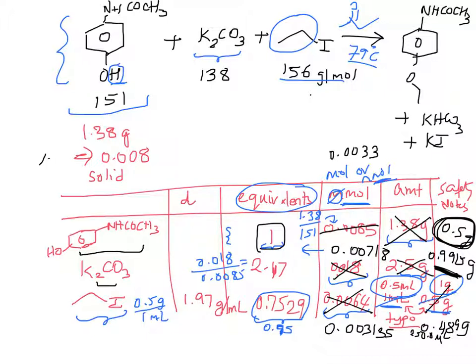I believe it was 15 milliliters of the 2-butanone, right? So since the ratio in terms of moles is about 0.388, my solvent could be approximately around 6 milliliters or so. And that should be plenty. And to that, I'm going to then add just about 250.8 microliters of the ethyl iodide and reflux it for 1 hour.